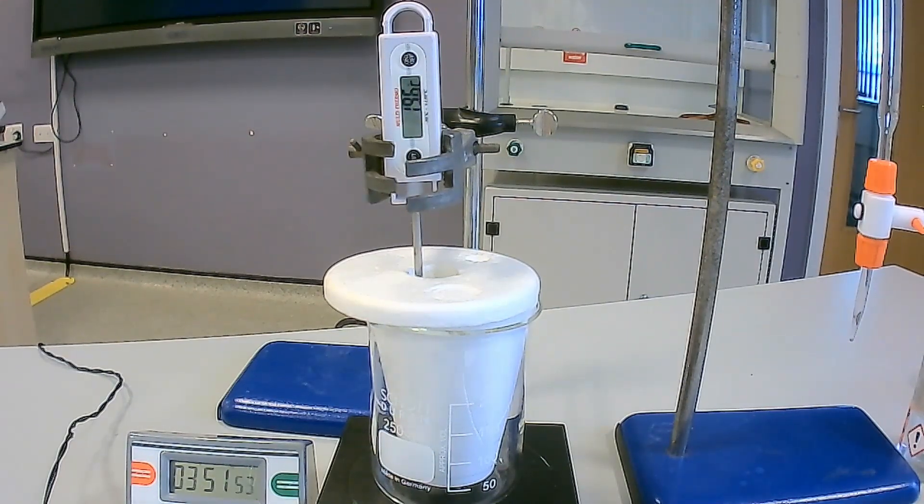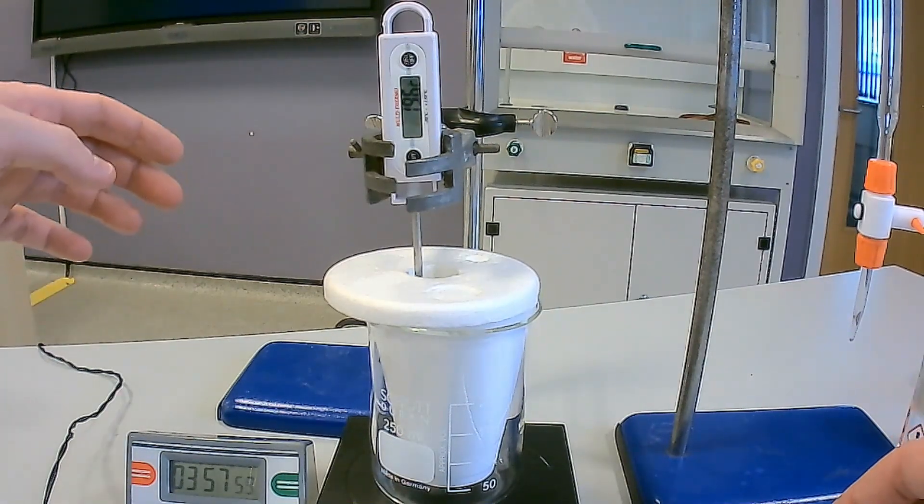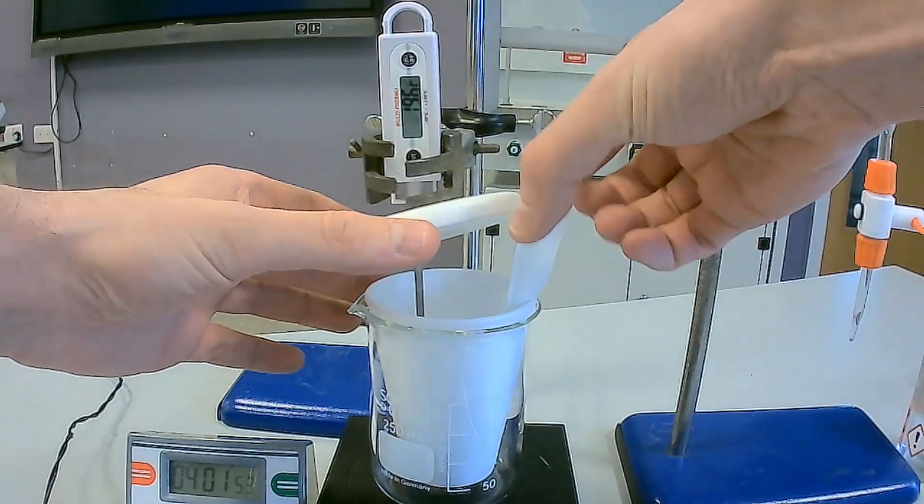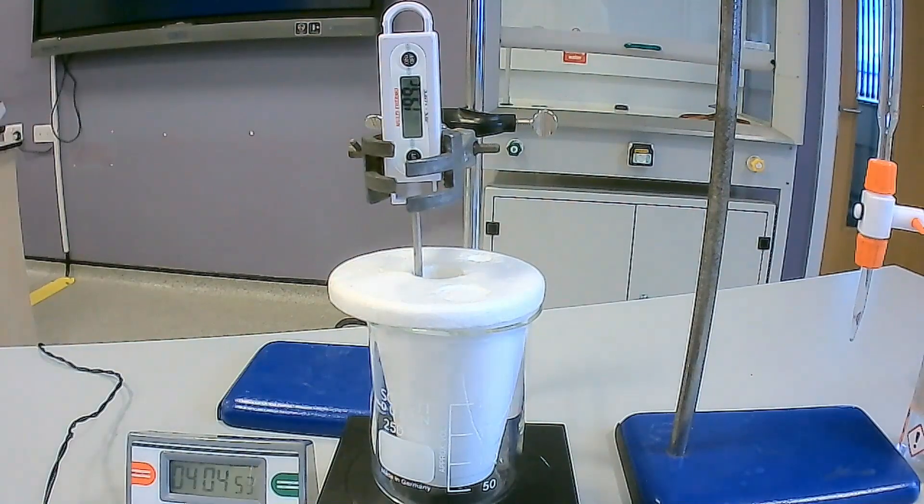At four minutes on the stop clock, do not record the temperature. Instead, lift the lid and add the anhydrous sodium carbonate weighed earlier to the polystyrene cup. Take care as effervescence will be observed. Then replace the lid.